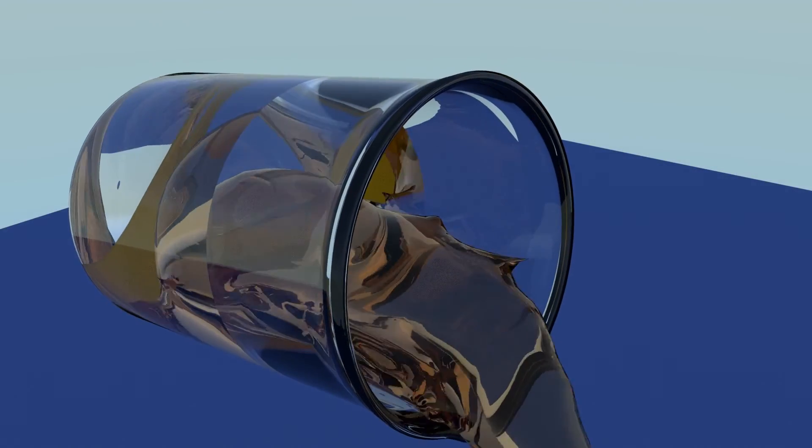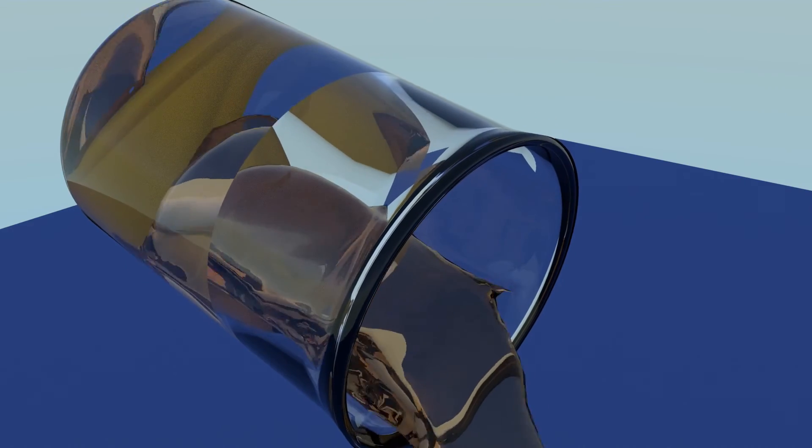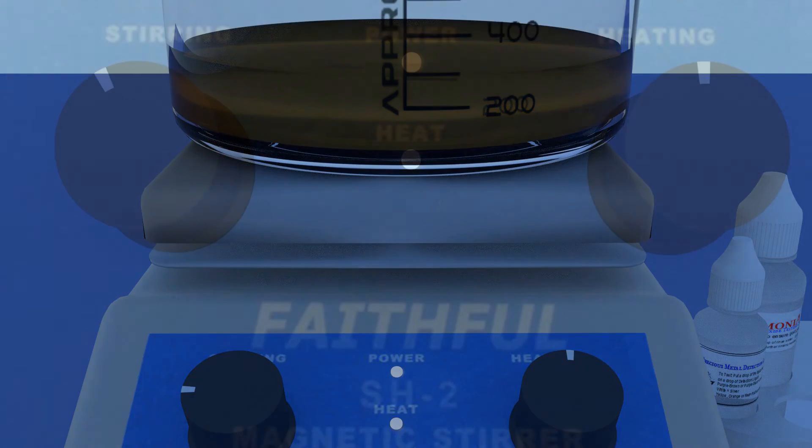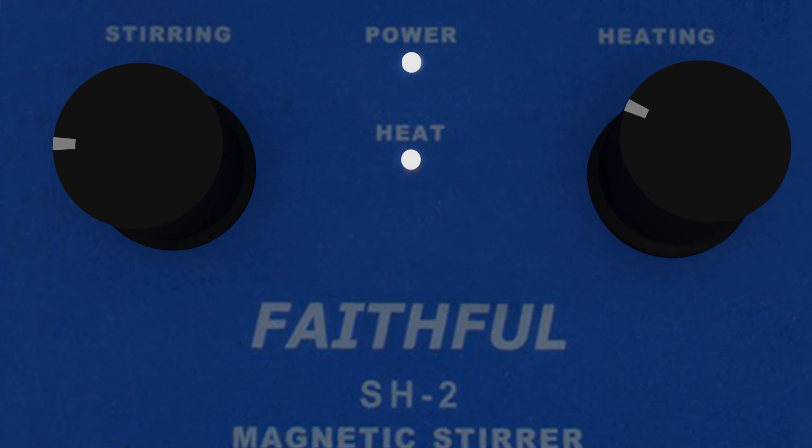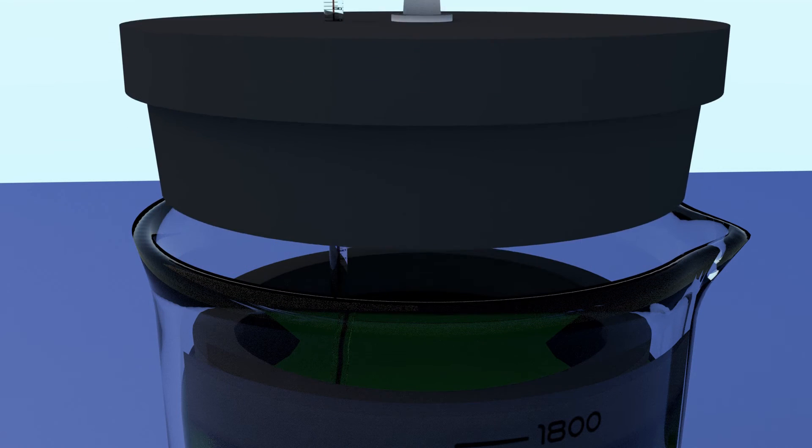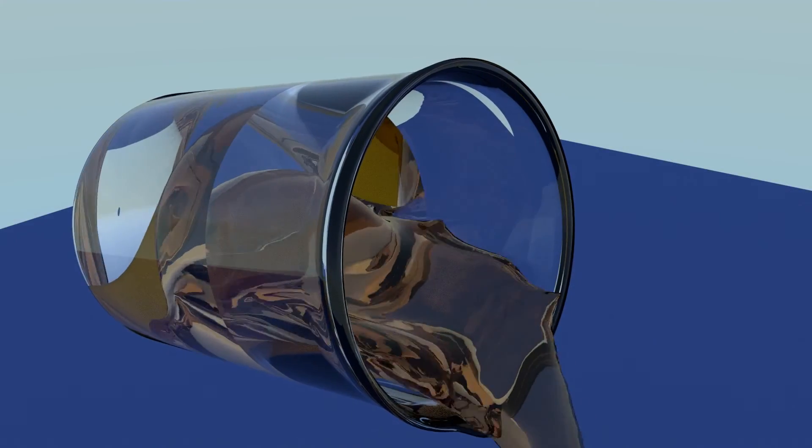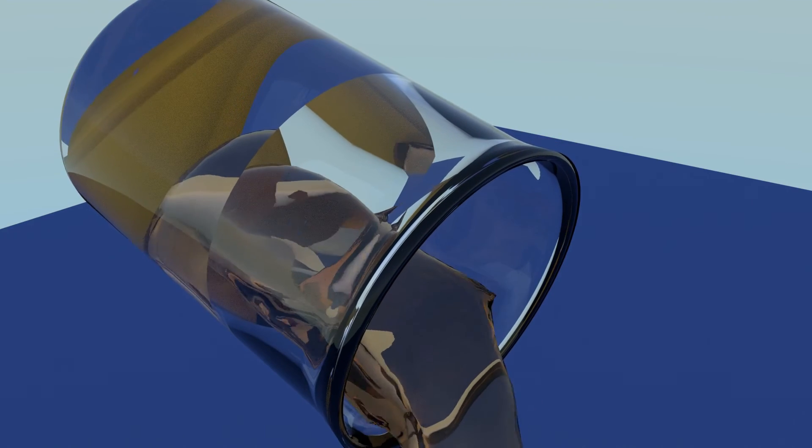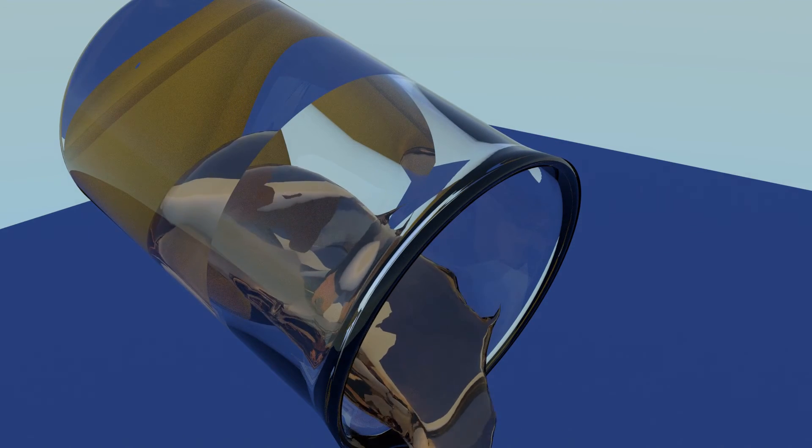Now that all the gold has precipitated, it's time to decant the acid and recover the highly purified gold powder. Turn off the hot plate and bring the beaker outdoors or to a well-ventilated area, and then remove the cap. Decant the solution into a bucket or any other glass or plastic container, being careful not to pour off particles of gold with the solution. If you used the recommended chemical ratios, then the particles should be quite heavy and remain in the bottom of the beaker while you pour off the solution.